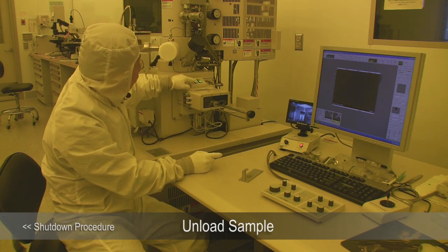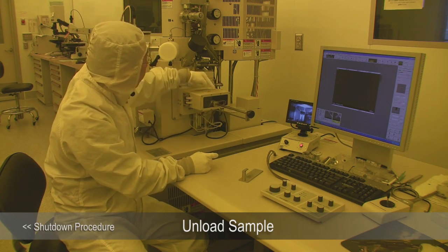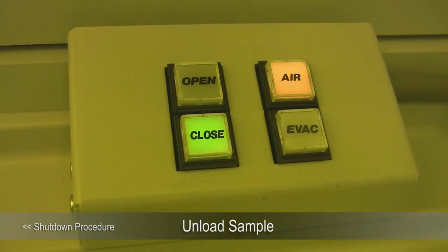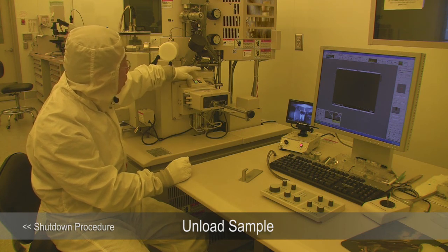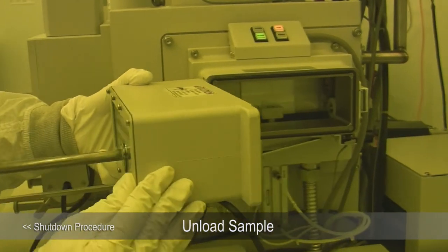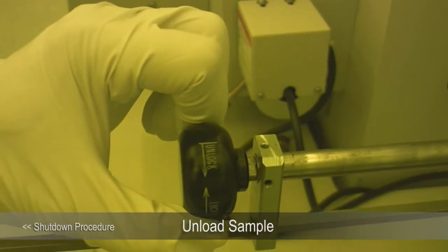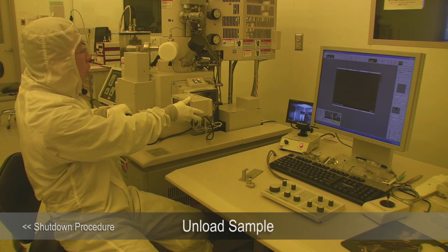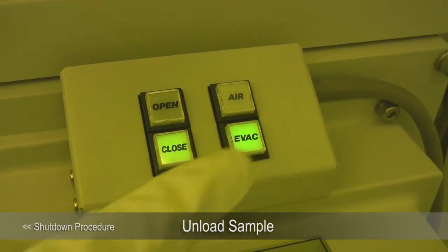Press the Close button to close the gate valve. After the gate valve closes, run the load lock to atmospheric pressure so you can retrieve your sample. Press Air to vent the load lock. When it stops flashing and you hear the beep sound, you can open the load lock door — open it with two hands. Push the exchange lock in a little bit, go to the unlock position, grab the sample holder, and pull it all the way back out. Make sure you pump it back down — you don't want to leave the load lock in air overnight.